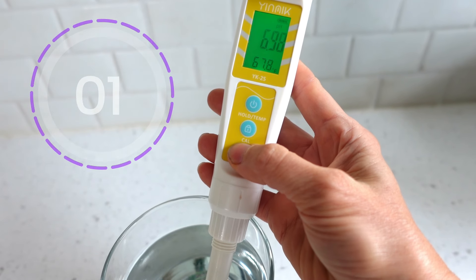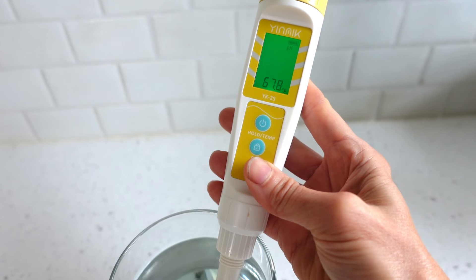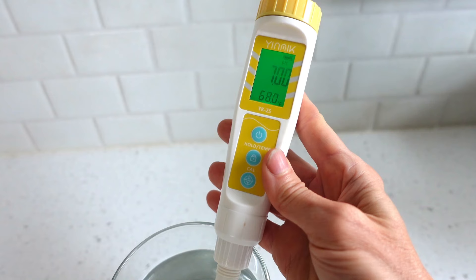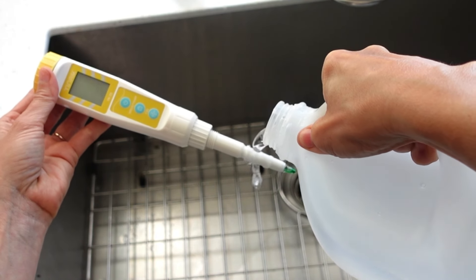Press and hold for five seconds, then release. The display will flash, then complete. Power off. Remove from the solution, rinse, and dry.